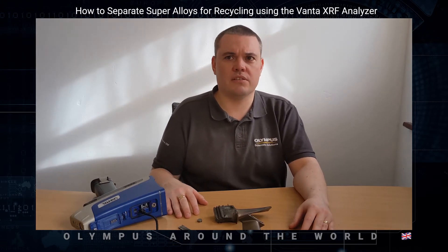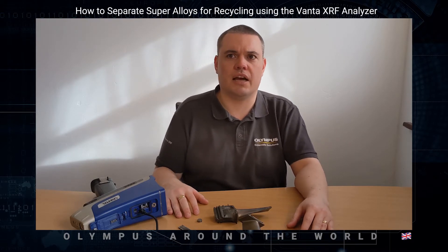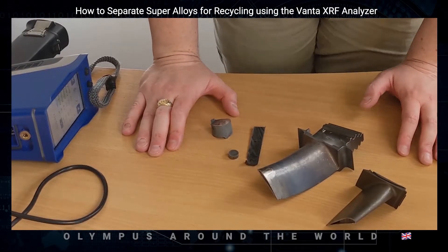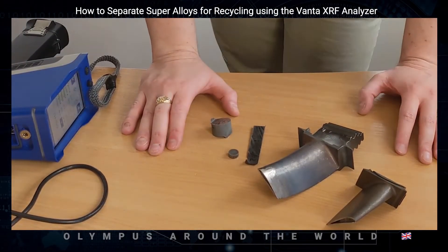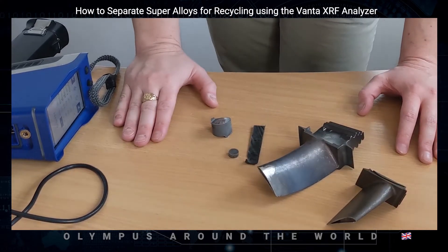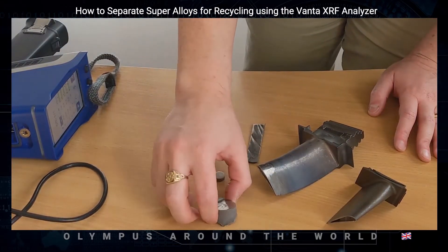The Olympus Vanta's highly precise and accurate results can also ensure correct melt chemistry and any requirements for blending. This means that the chemical analysis of these exotic elements is critical to correctly determining the alloy grade. Here I have a few typical samples of super alloy components being sorted at a recycler — a couple of engine turbine blades and some small off-cuts of different alloys.